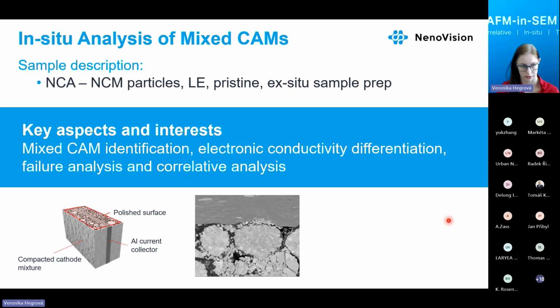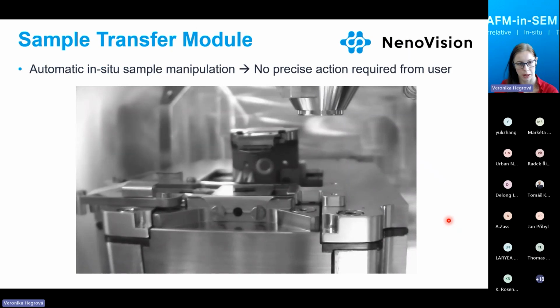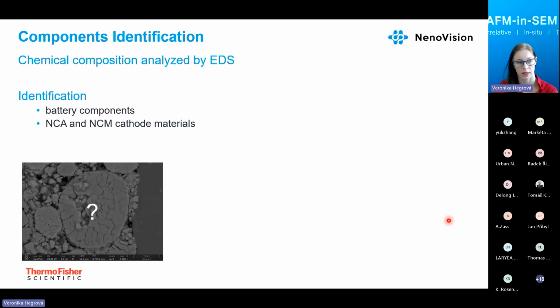So the question was identification of mixed cathode active material and electronic conductivity differentiation according to different CAM particles, and also whether there is any failure in the device.